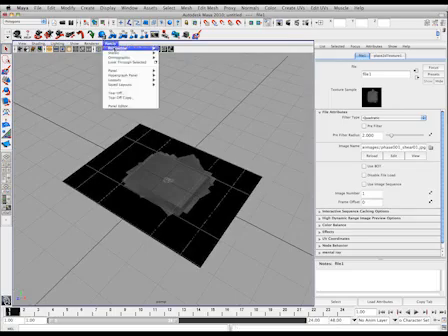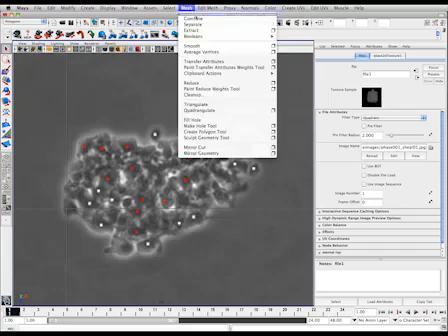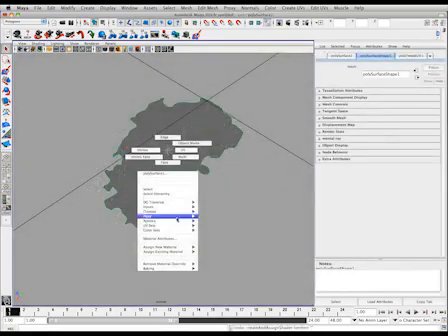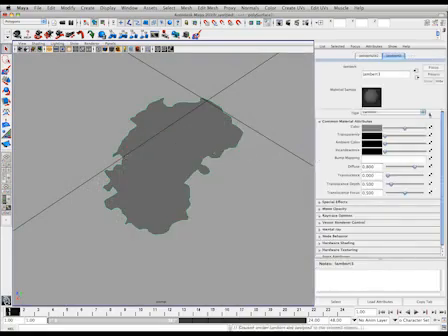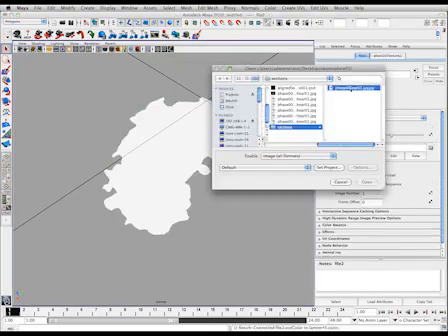Switch the camera of the workspace window from the perspective view to the default orthographic top view by opening the Panels tab. Select the Create Polygon tool from the Mesh tab of the main menu and trace the outline of the section. Choose the first map from the Source Images folder and assign it to the newly created polygon plane following the steps established to create the polygon plane.